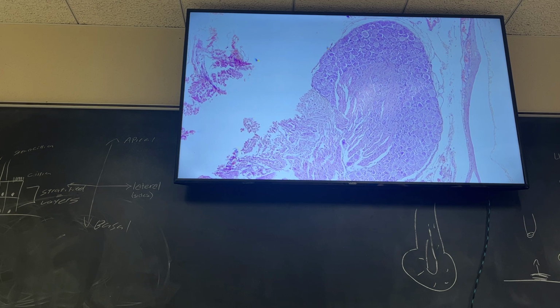There is some fat in there. There's also the dorsal root ganglia there, as well as some muscles and other things, but a lot of that is to protect these dorsal root ganglia. So these dorsal root ganglia are the structures that control the communication into and out of the spinal cord.